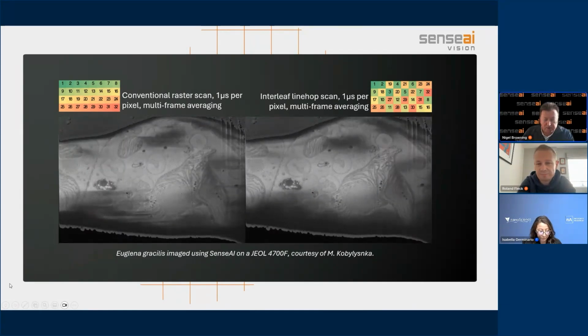Okay, great, thanks. And so where do you think this will go in the end? What's the dream of the process that we use? So the dream's fairly straightforward. If I can vitrify everything, single cells, blocks of tissue, using high pressure freezing, for example, and then volume image them in the cryogenic state, the organization of the cells, their organelles, is really as it was at the point of freezing. So it's as close to perfect as you can get.